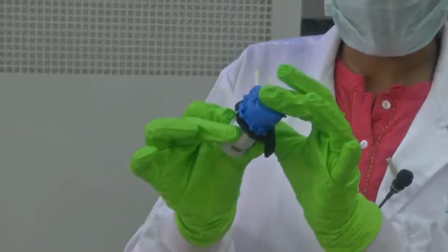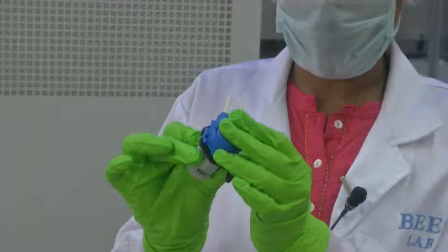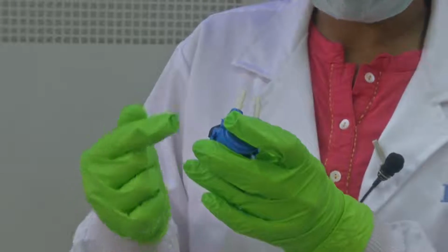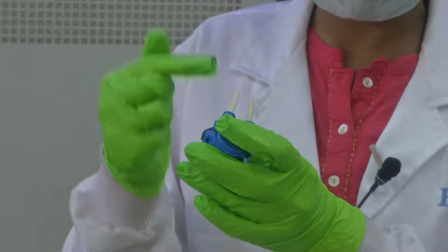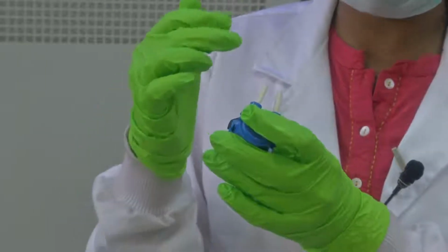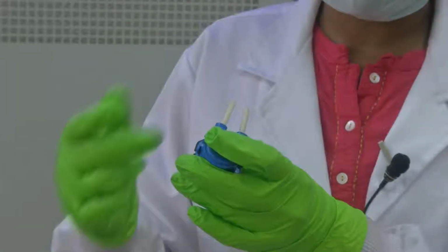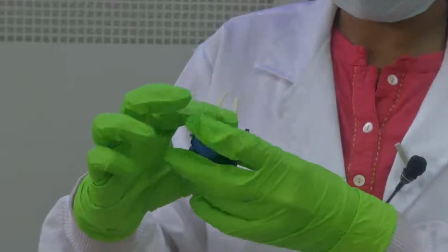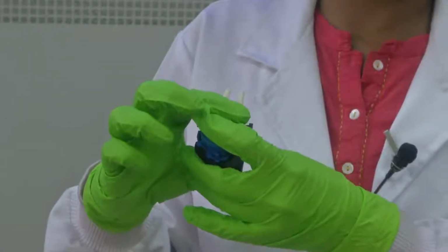Now let us see what kind of pump is used in microfluidic devices or a biochip, where you mimic the biological environment and flow different chemicals. You might flow a drug and test the susceptibility of a particular kind of cells, or you could load in cancer cells and test how the drug works on each of these. So let's look at how the peristaltic pump can be used in flowing fluid through microchannels.